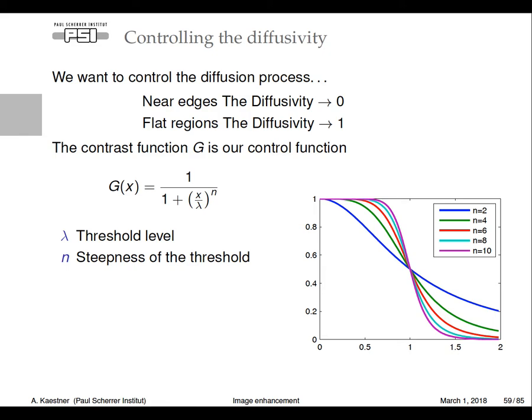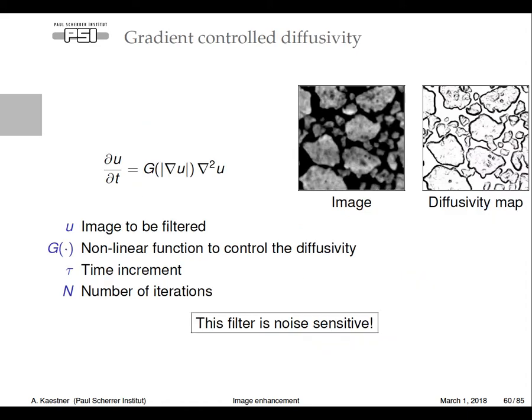And for that, they have come up with an equation, a threshold equation that essentially controls this for us. There's a few parameters that you can play with, but the sensitivity can be controlled to be more or less steep depending on how strong you want to filter. And then afterwards, we can get a revised equation looking like this. So this is the new diffusivity.